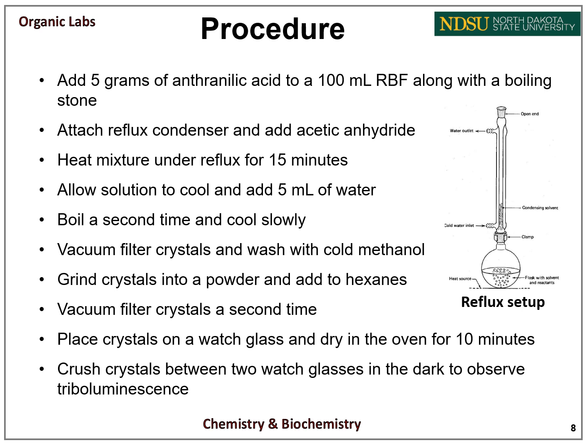Grind the crystals into a powder and add 2 hexanes. Then vacuum filter the crystals a second time. Place the crystals on a watch glass and dry them in the oven for 10 minutes. Then crush the crystals between 2 watch glasses in the dark to observe their triboluminescence.